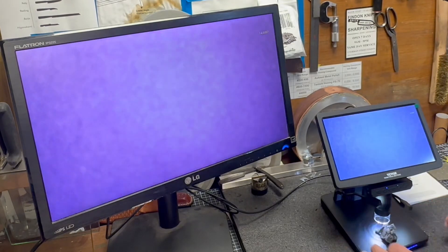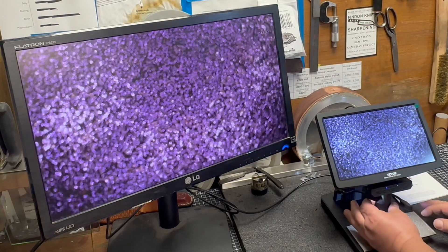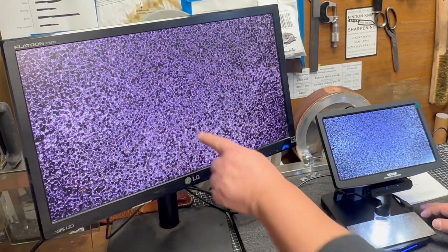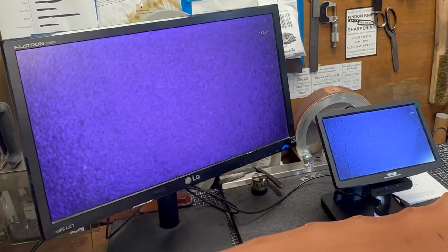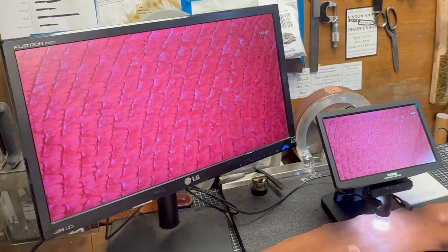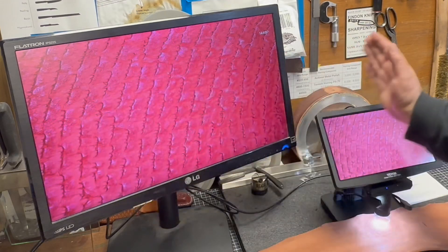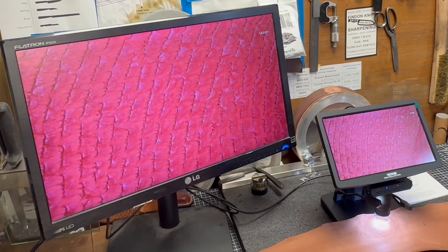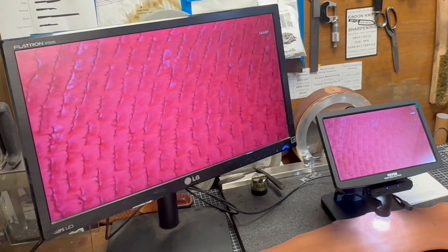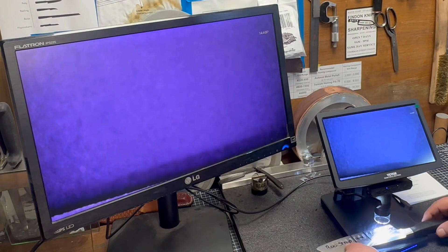Here's some steel wool - interesting. Here's my diamond plate, 80 grit - there are the little abrasive guys. Here's some kangaroo tail leather - we can see what's grabbing the root of the burr and ripping it out. Isn't that interesting? So that's what happens as we wipe our knives over it - it dislodges the root of the burr. Let's go straight on to this knife.